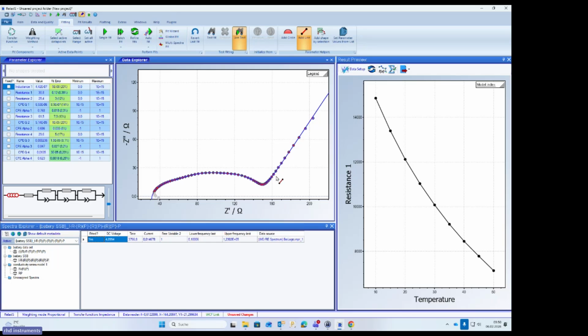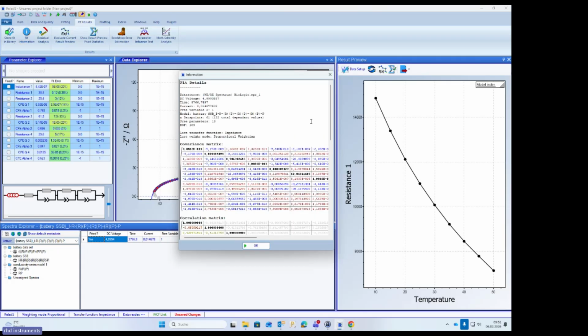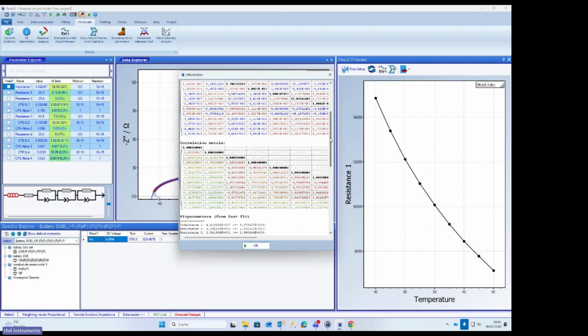However, now I've told you quite a lot about what options you have in terms of fitting. There are only 2 different topics or 3 different topics left. One is you might be interested also in learning more about what do you have in terms of fit results. So what can I learn from the fit results? Here's this tag. And under this tag here, I can just click here on fit information. So I get all the fit information for all the spectra here.